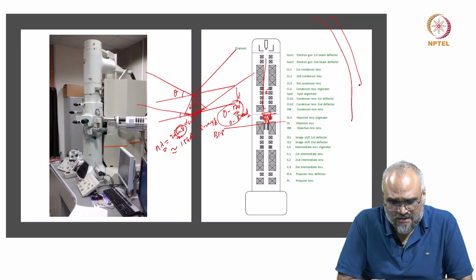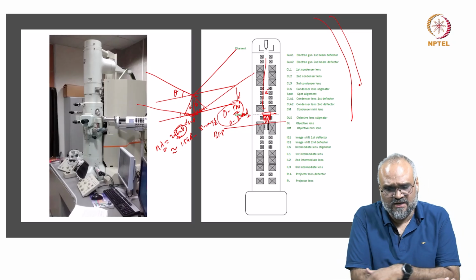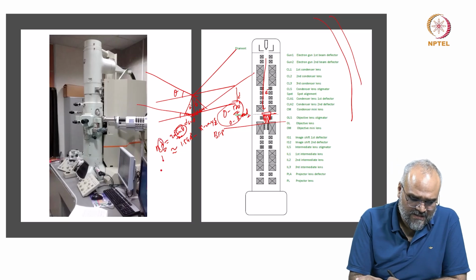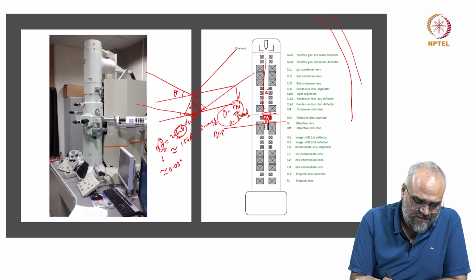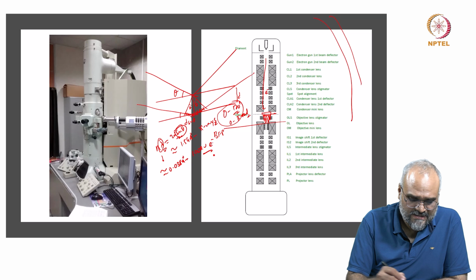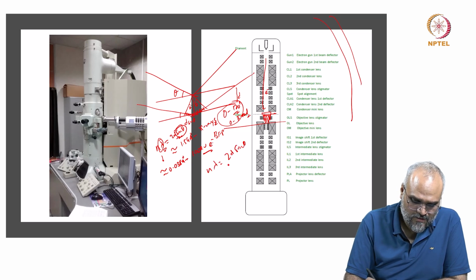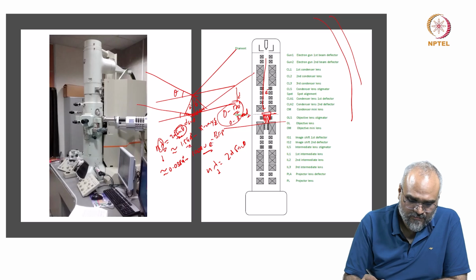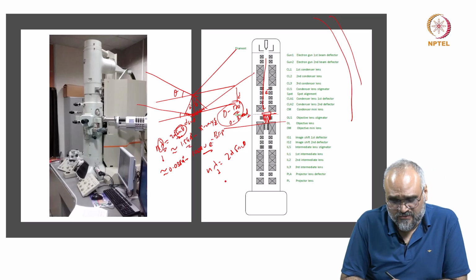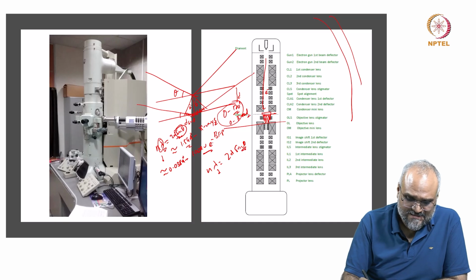Now, when I look at how this changes in the context of electron microscopes, lambda here is of the order of 0.038 angstroms if I have a 100 kV electron beam. So if I use this in Bragg's relation, my lambda is already lower by 3 orders of magnitude, and as a result this angle theta becomes extremely small.